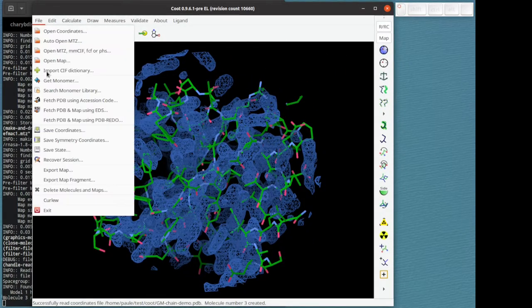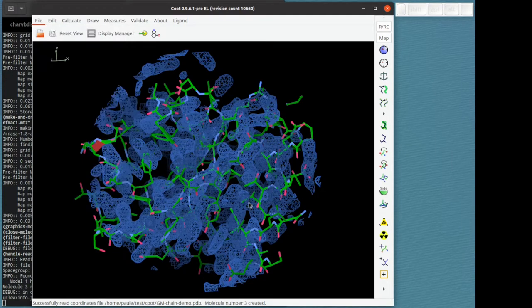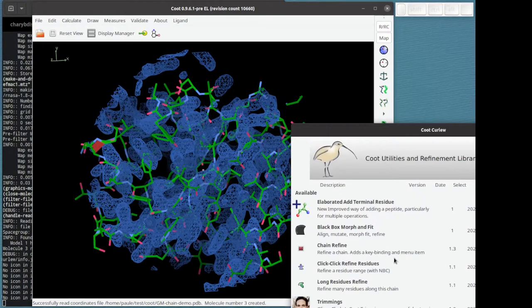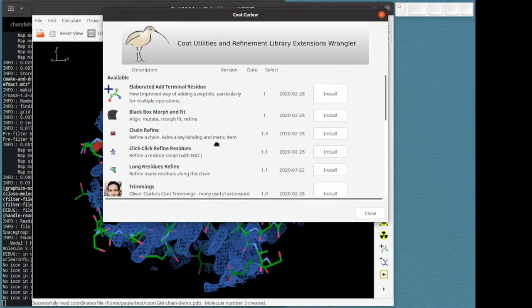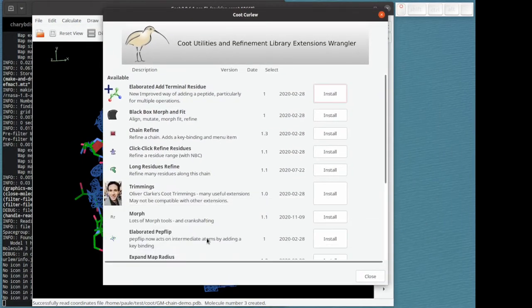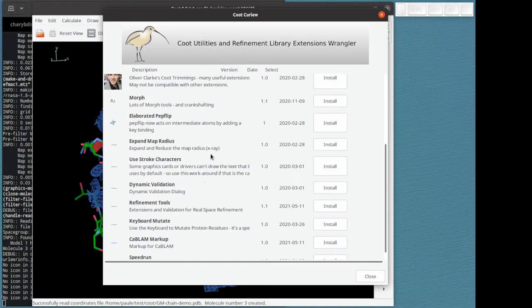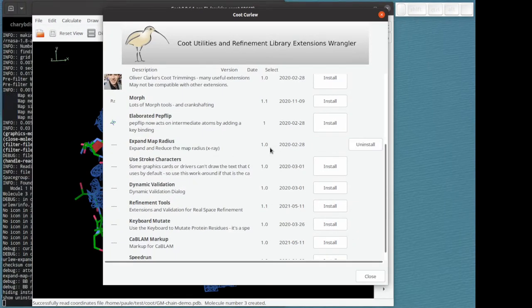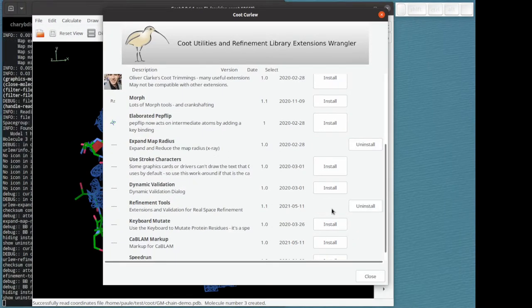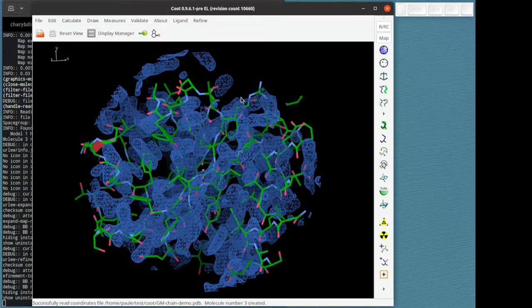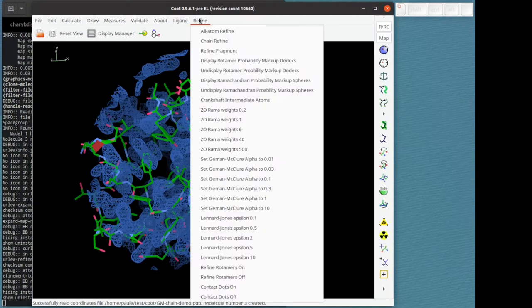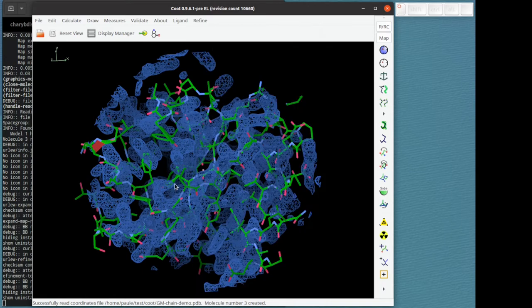Now we're going to ask Coot to provide a couple of extra functions if we haven't downloaded them already. So expand map radius and refinement tools. Refinement tools has provided this extra menu here.